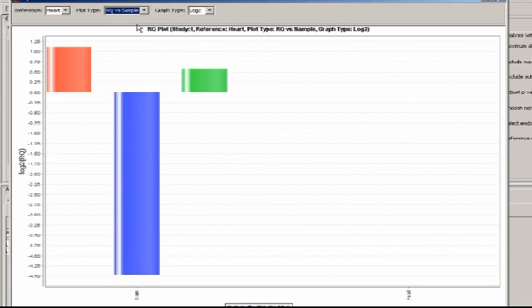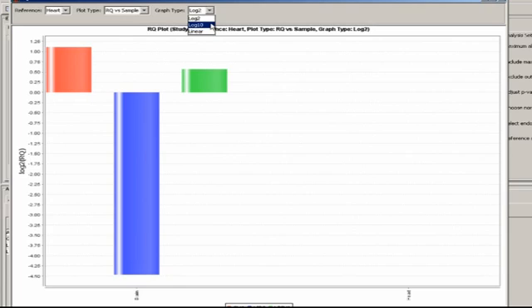The scaling can also be altered, from either a log base 2 or log base 10 scale to a linear scale.